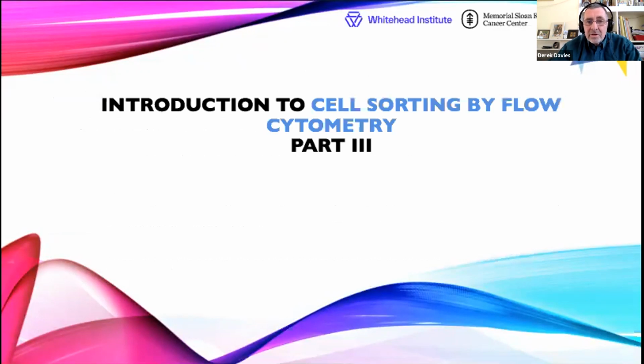So this is the third of our sessions on cell sorting. We're going to follow on from some of the things that we learned in the first two sessions. And again, today we're going to be using the FACSAria. There's a little bit of a difference today in that you'll notice that Rui is sitting in the lab. Kathy gets to sit in, if not an office, her home and help out.